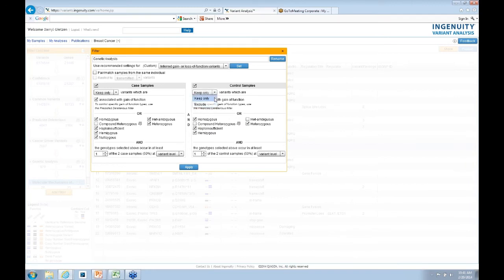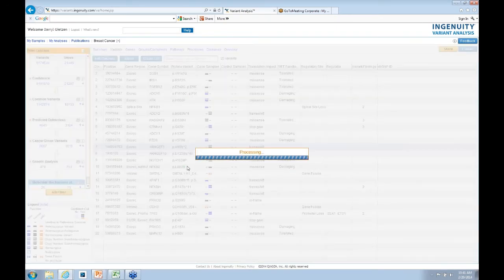I'm going to want to say, well, let's keep only heterozygotes, and let's just keep the question simple. And I want to see if I also see homozygotes. I guess hemi or nullizygous would qualify over in my cases, and apply this.